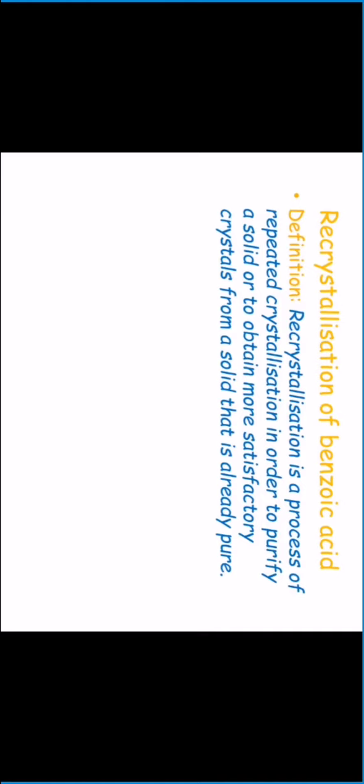So recrystallization is a process of repeated crystallization in order to purify a solid or to obtain more satisfactory crystals from a solid that is already pure. So I would always say that recrystallization increases the purity of a sample that you are working with.